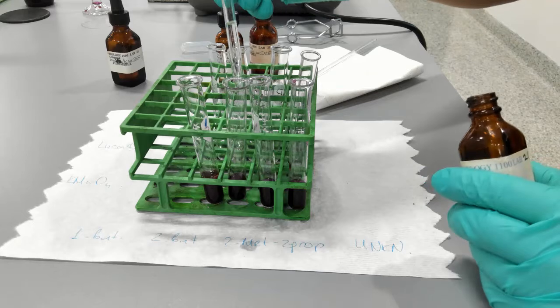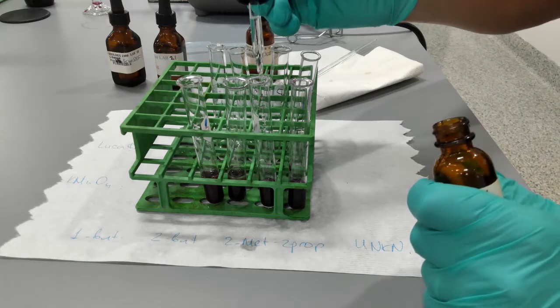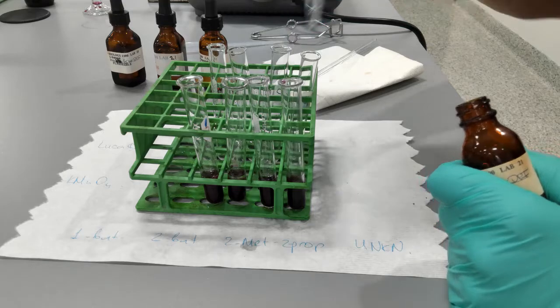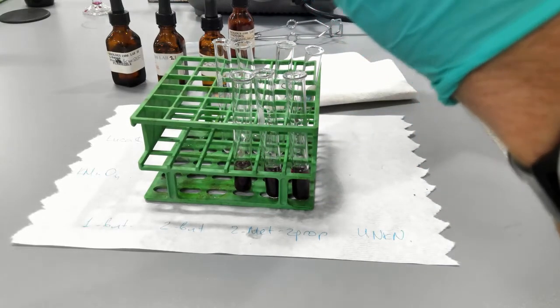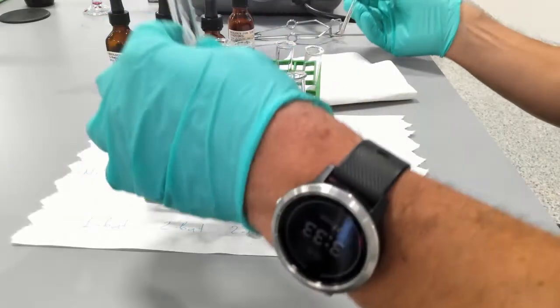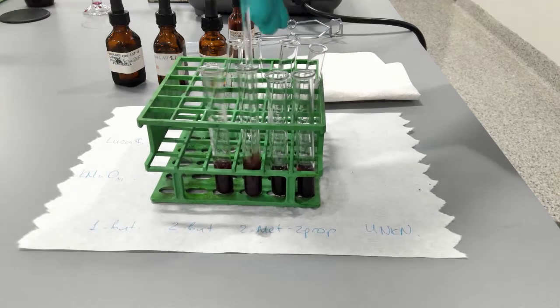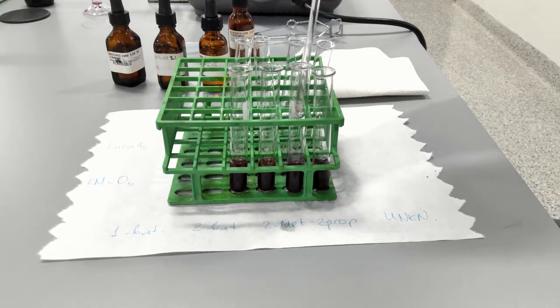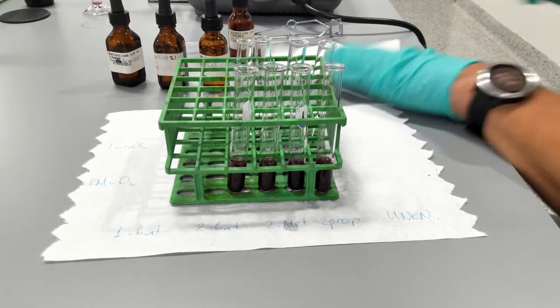Add some more alcohol and see what happens. So now we're going to wait for the results.